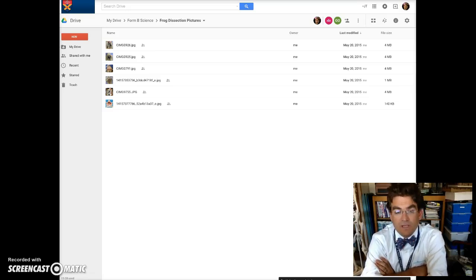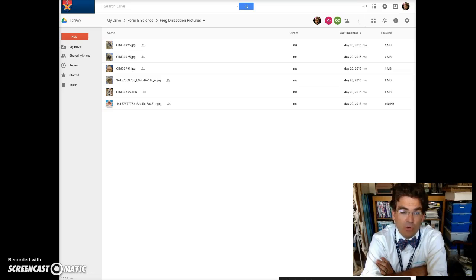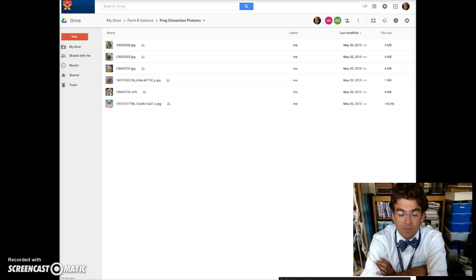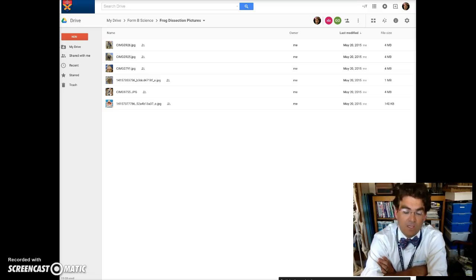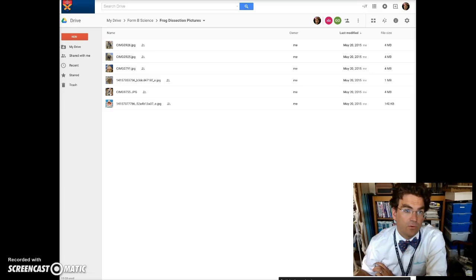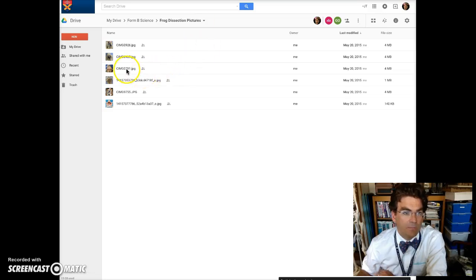Hello Form B. This is a recap of our frog dissection. We're going to go over the two main parts of the frog that you need to identify for your lab report. We're going to first look at the mouth and identify all those parts, and then we're also going to look at the internal organs and go over those parts as well. You have all been shared this folder called Frog Dissection Pictures, and we're going to first look at the mouth, so I'm going to bring up that picture.